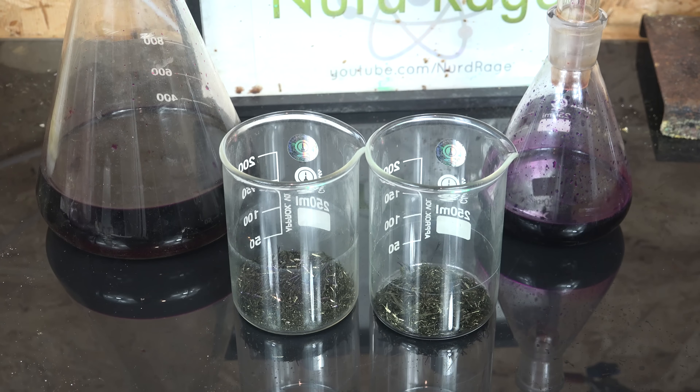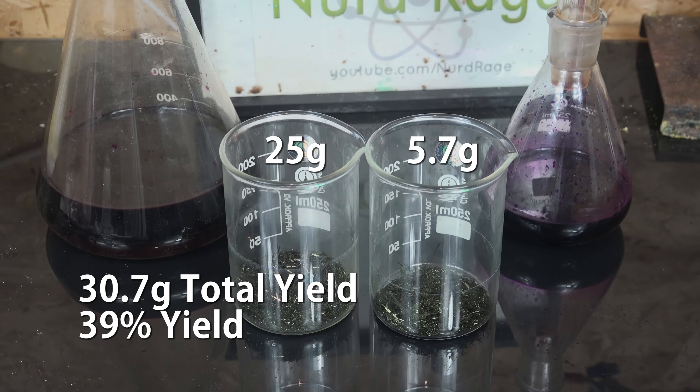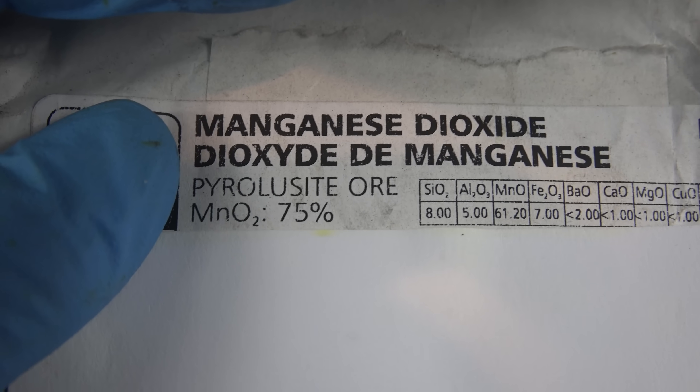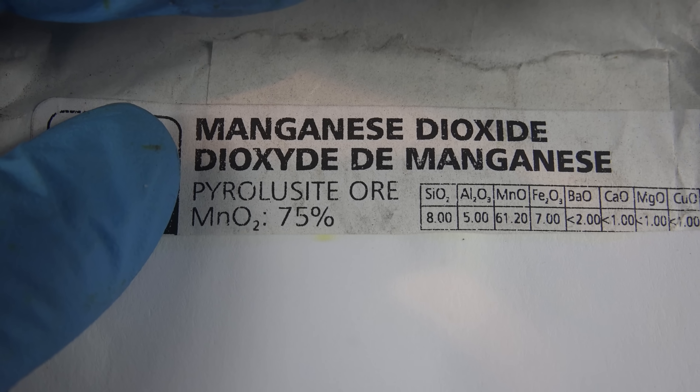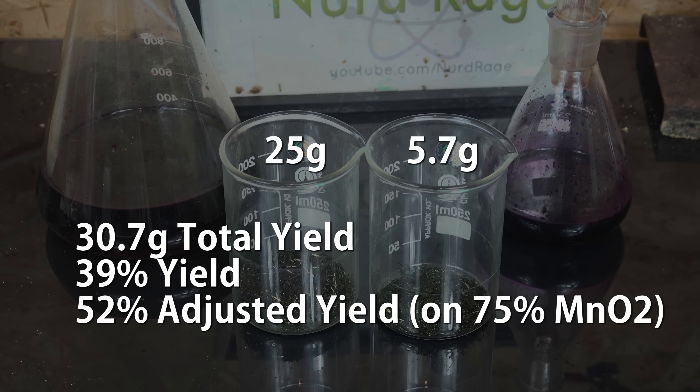Total yield is around 30.7g, or 39%. But since the manganese dioxide I used was pottery grade and was assayed to be 75% pure, our adjusted yield would be 52% going by the assayed amount.